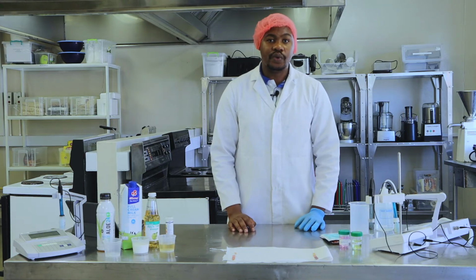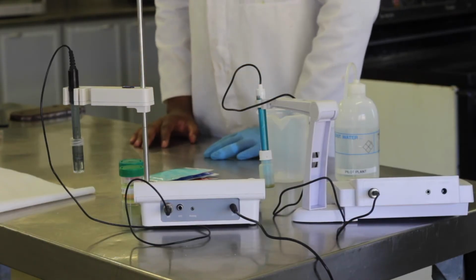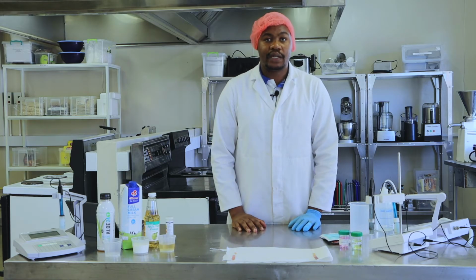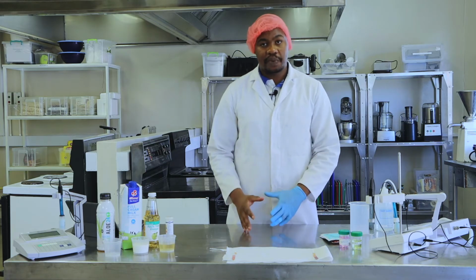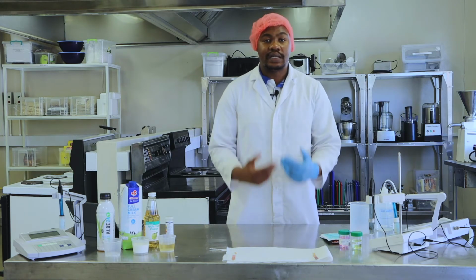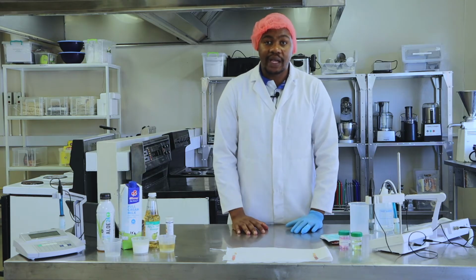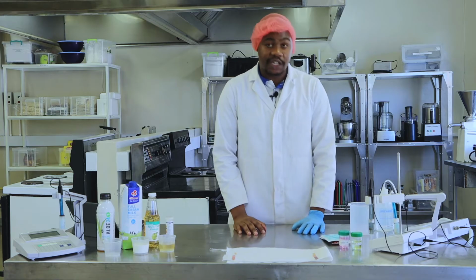But before you can use a pH meter, we need to calibrate it. All equipment that is used in the laboratory should be calibrated. If you are using scales, they should be calibrated. If you are using a pH meter, it should be calibrated. By calibration, we mean resetting the equipment or tools in order to check if they are still functional and within specification.